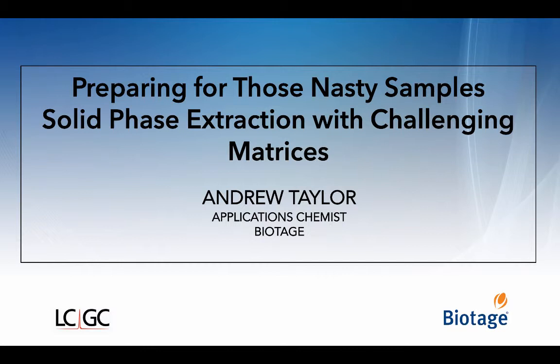And this layering technique really allows for the analysis of those really tough samples. What do you do if your disk clogs partway through an extraction? This is a really interesting scenario. If proper pre-filtration is not used and the disk clogs or becomes too dirty to flow through the disk, there are a few different things that you can do.